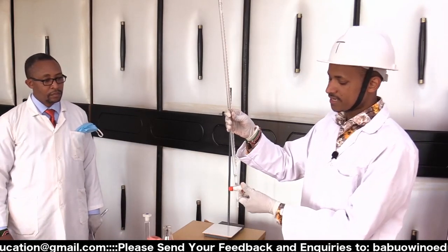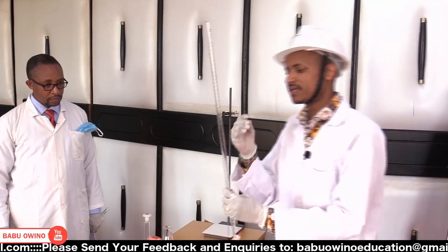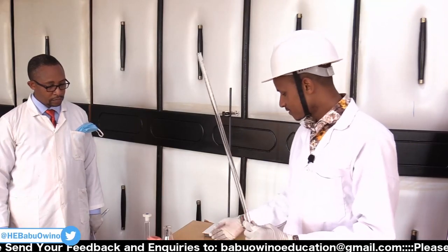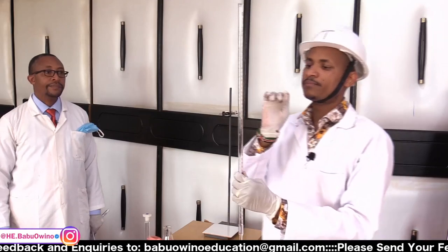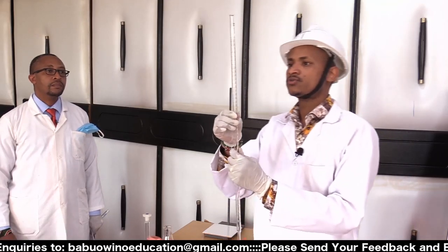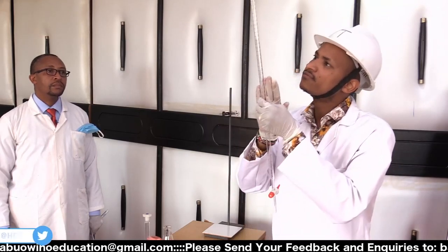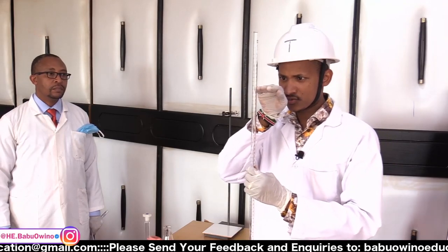You don't close it so tight, just ensure that it is firm, not tight. Then when you are reading all the apparatus, that is the burette, the pipette, ensure that you read it perpendicularly. So ensure that you don't read it from up, don't read it from down, but read it at the eye level.